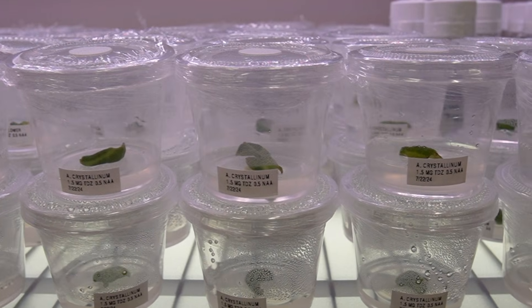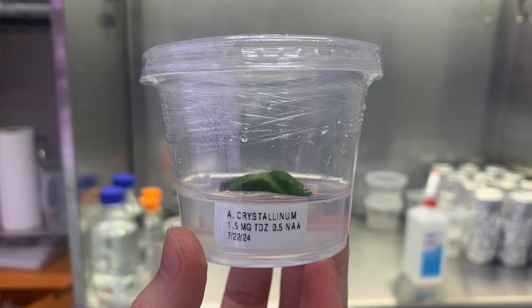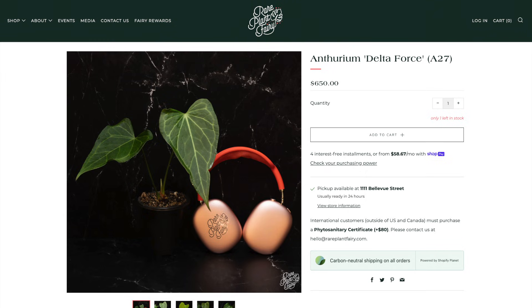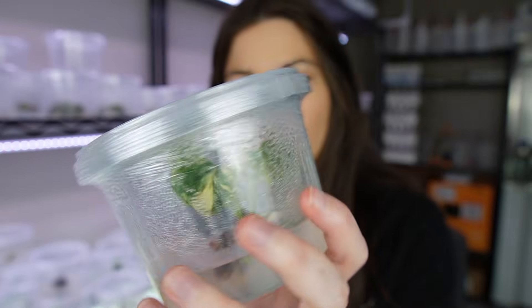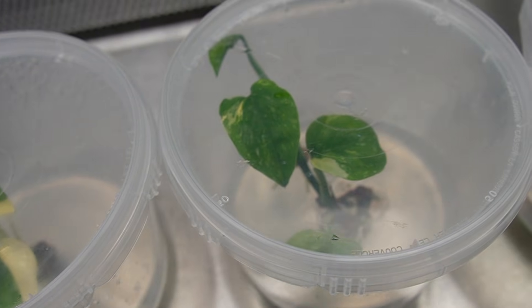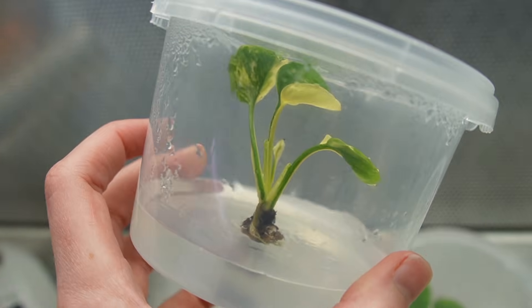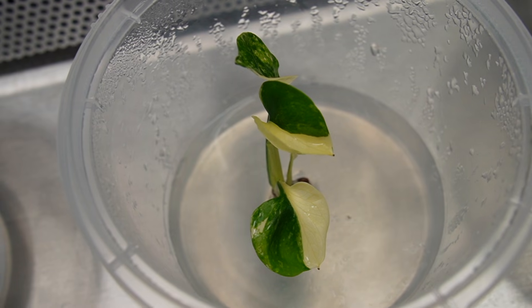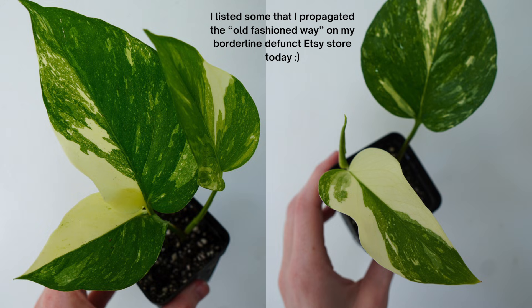I also used that same exact media for my anthurium crystallinum. If I can successfully generate new anthurium plantlets through callus culture then I definitely want to start working with some more expensive anthurium varieties. The Colorado constellations are doing just okay — there's a lot of condensation in here so I'll post some better pics. I only got one shoot from each of the nodes, and although it's kind of successful because you don't get any contamination, in my mind it's ultimately a fail if you do tissue culture and then you only get one plant, especially because I had to use an entire node.